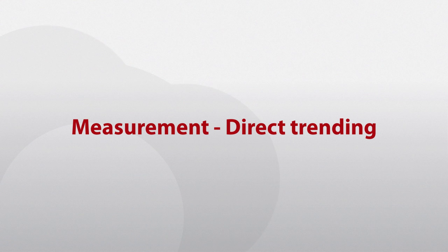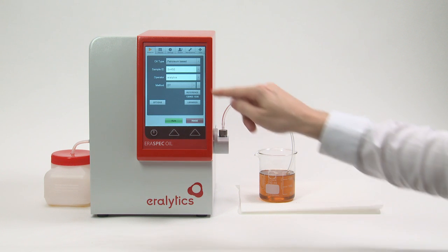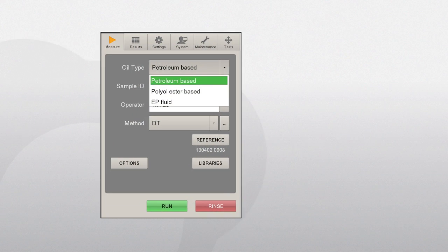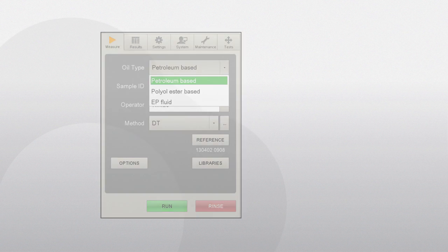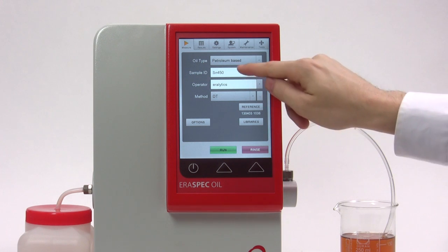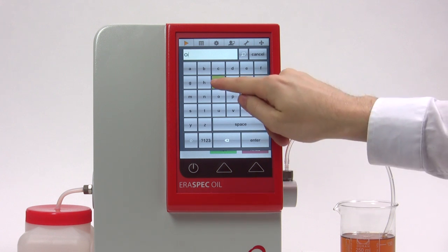To make a measurement using direct trending, the oil type, sample ID, operator, and method must be selected. Select the oil type for the oil that shall be analyzed — this will determine the standards used for evaluation of the spectrum. To enter a sample ID and an operator, click on the fields and enter the name via the keyboard.